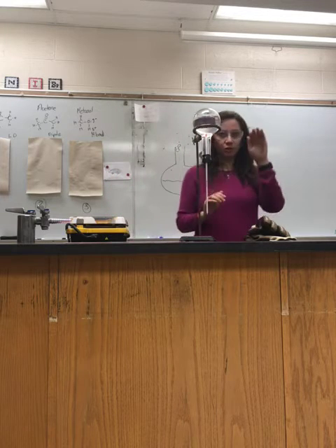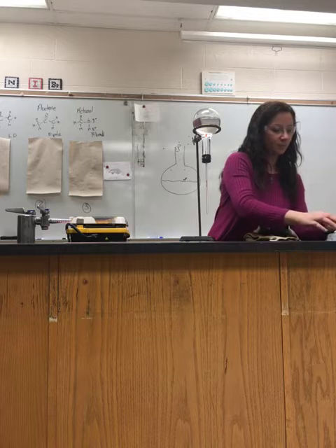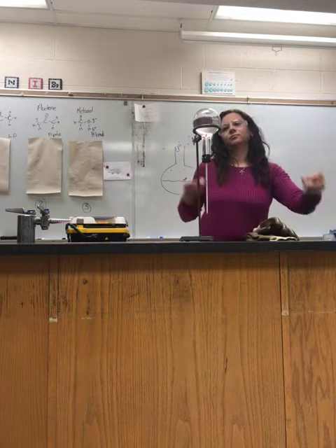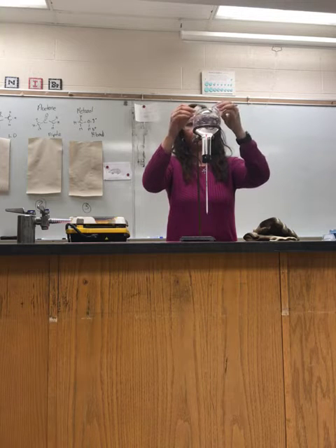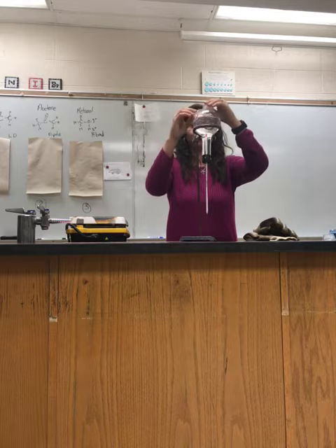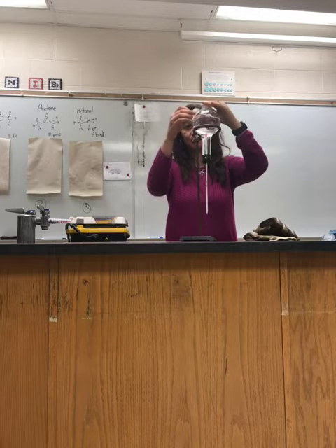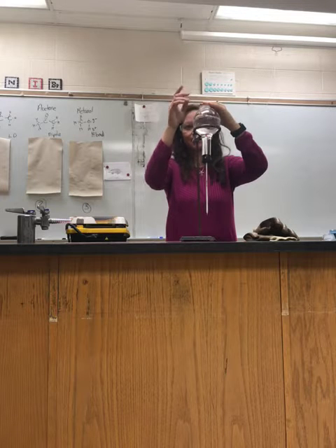So what I'm going to do next is I'm going to put some ice on top right here. And you see that it starts boiling. So we are actually boiling this water by applying ice to it. So how is that working? Well, let's think about this.